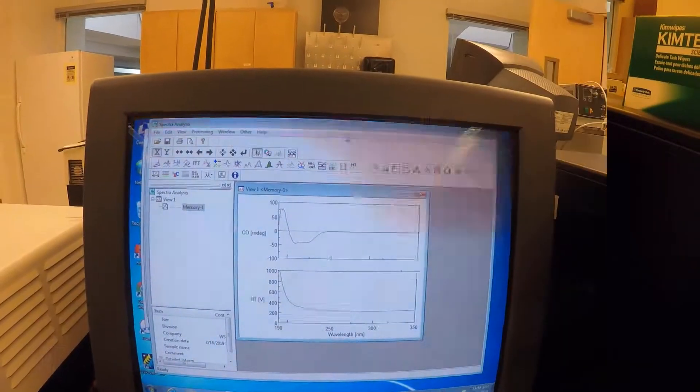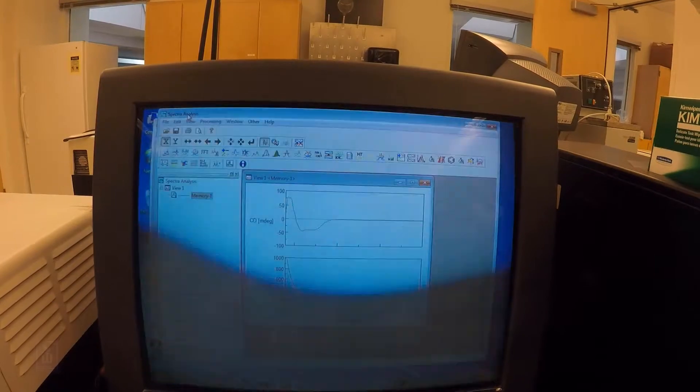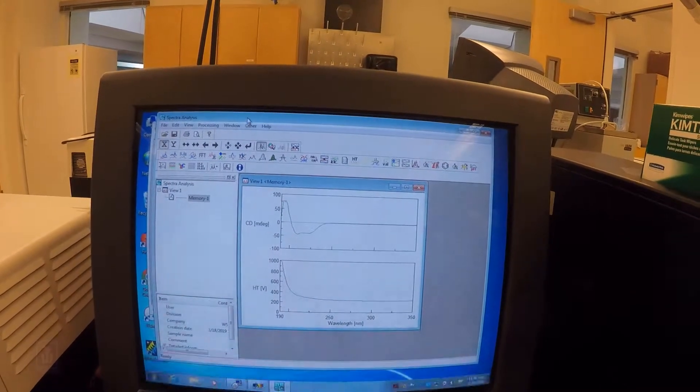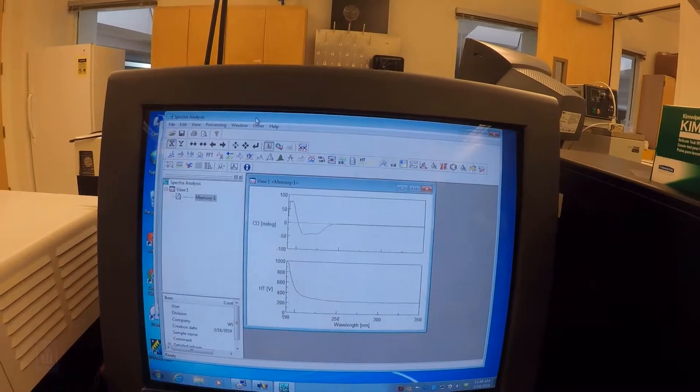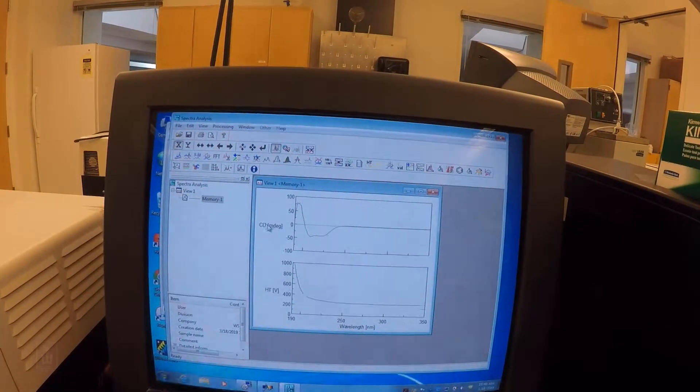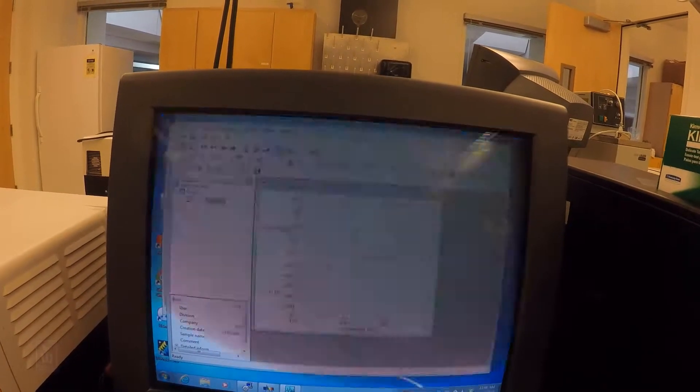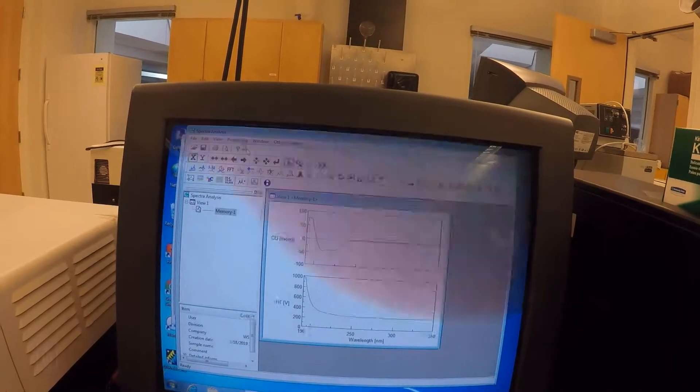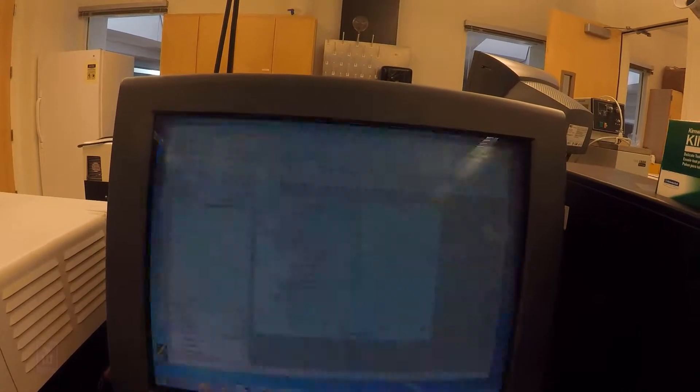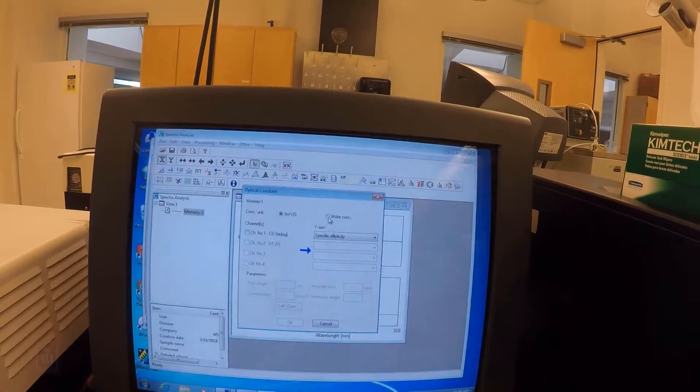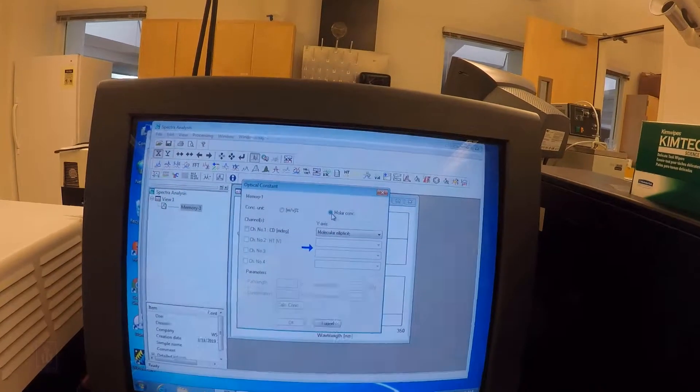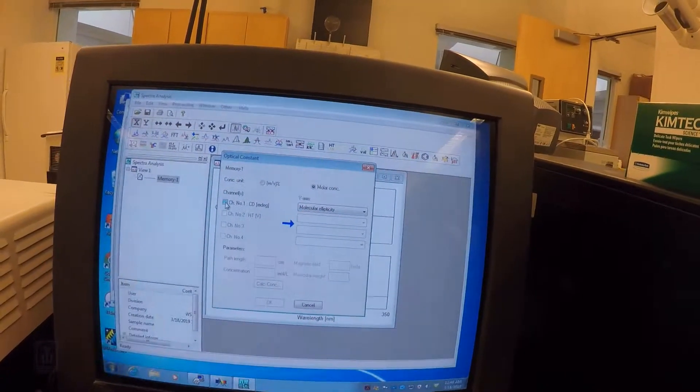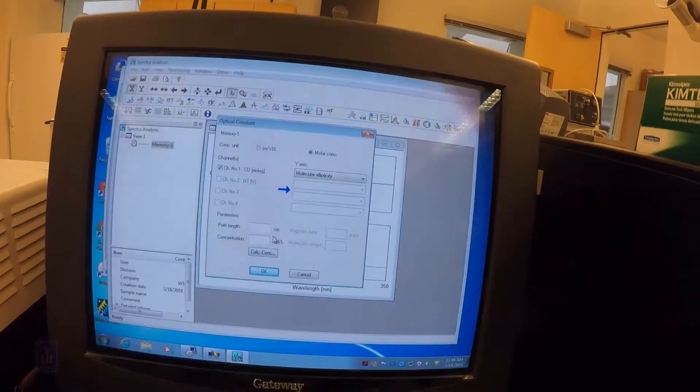Once our sample was done scanning, often this will just pop up automatically in our spectra analysis program. We'll need to do a little bit of post-processing with this to be sure we convert the units from circular dichroism, which are kind of a raw scale, into something that's comparable apples to apples. And so if you go to Processing, down to CD Options, you can go to Optical Constant. We have to put in a few different things for our concentration. I want to click on Molarity, and I want to get molecular ellipticity.